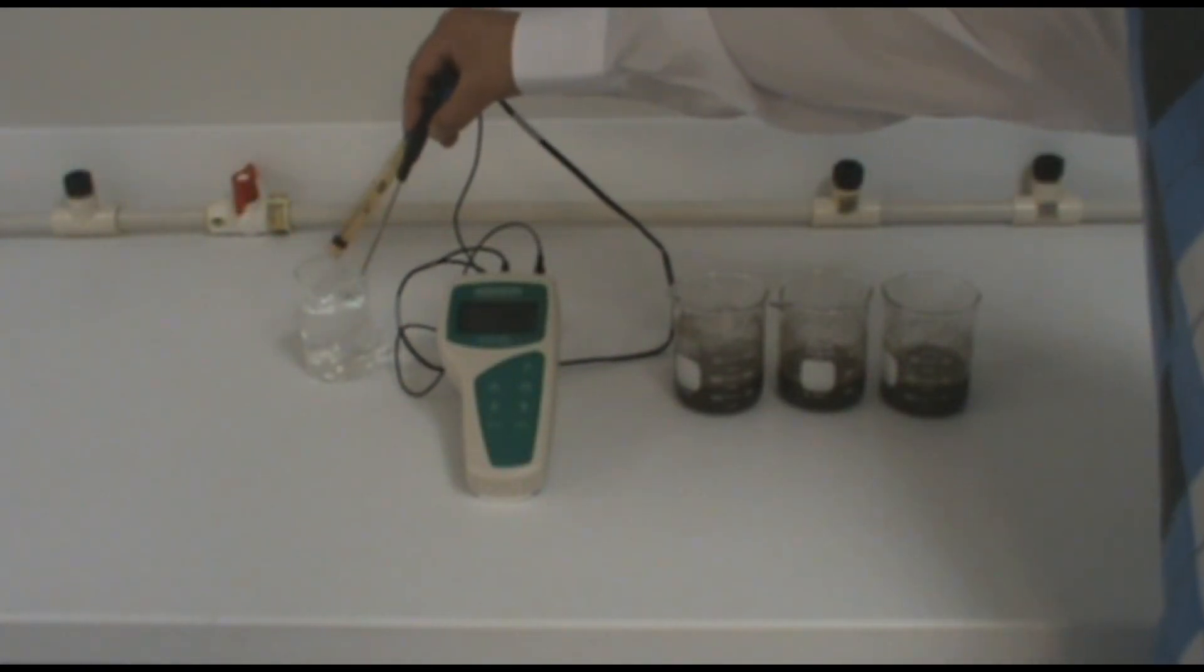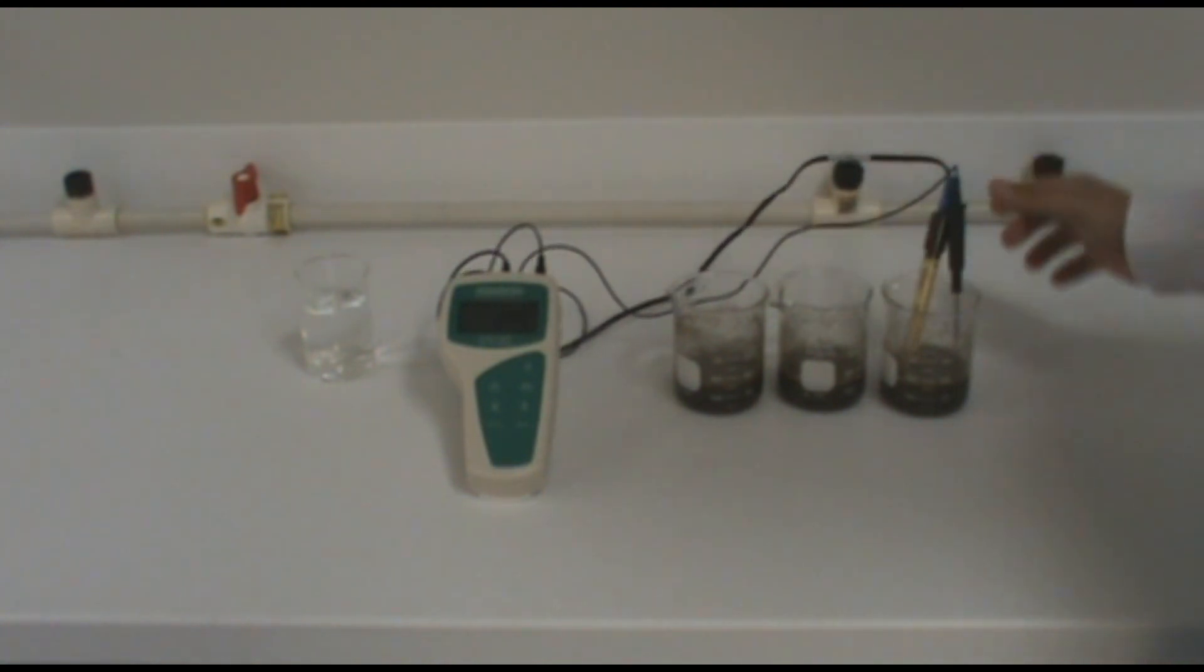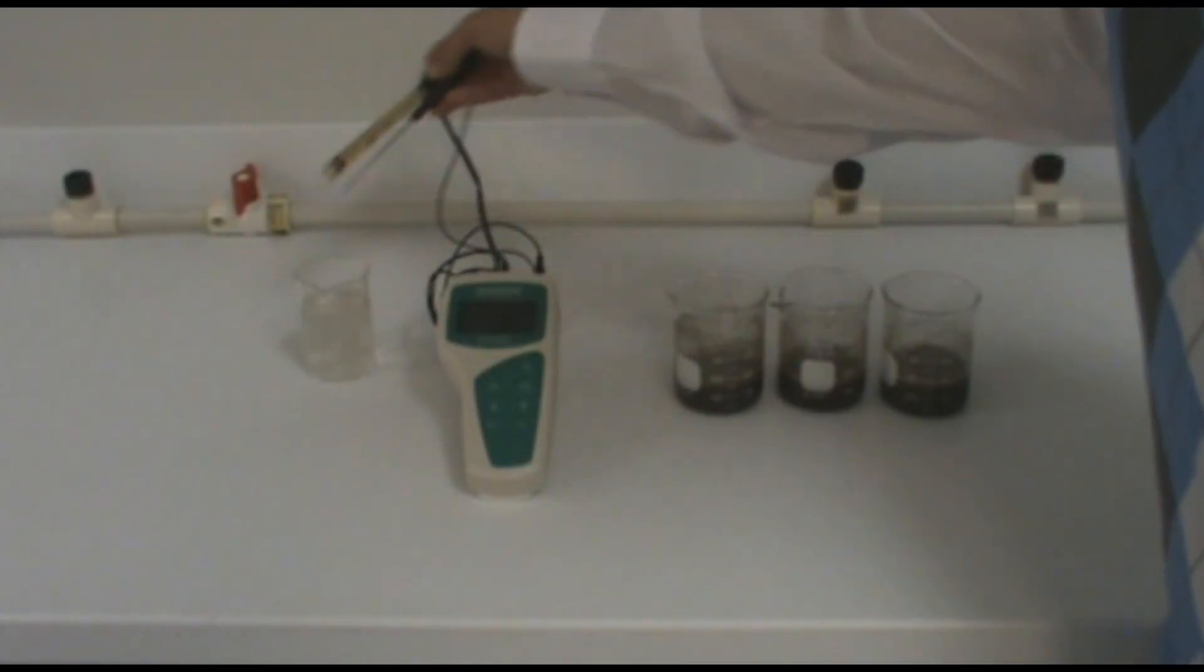Take the pH electrode and ATC probe and place them in the first soil sample. Allow the reading to stabilize and record this reading. You will then follow this same procedure for your next two samples.